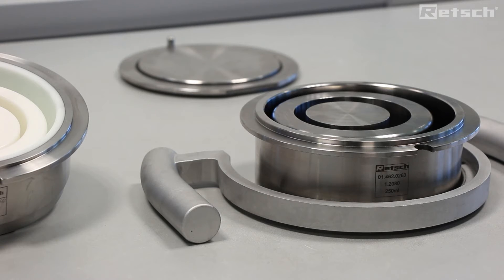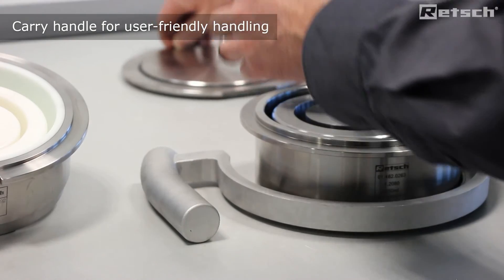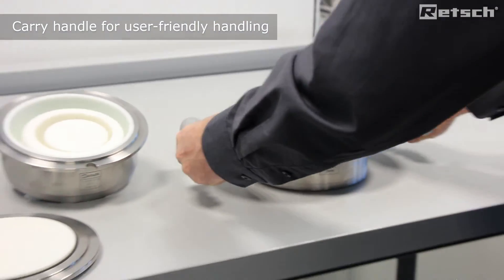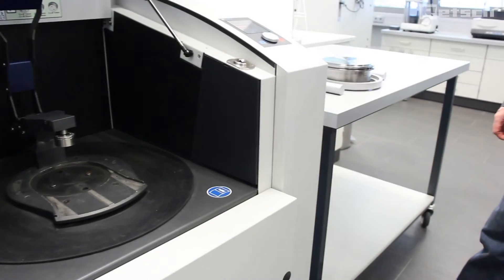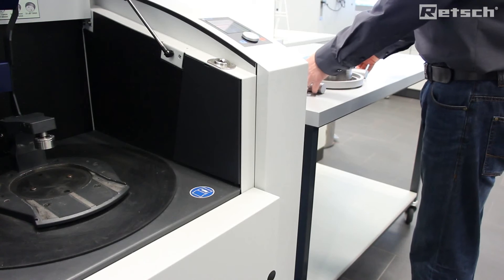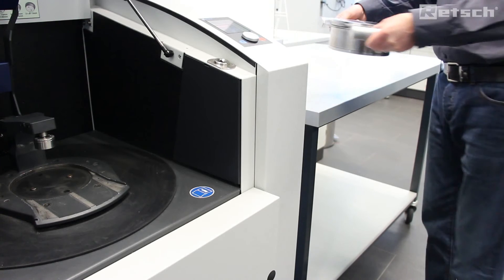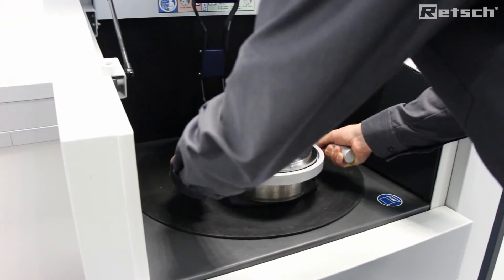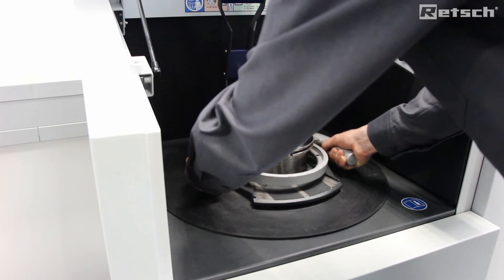The instrument is also supplied with a carry handle, which is used to optimize user-friendliness for carrying the grinding sets. We simply use the carry handle supplied with the instrument to transport the grinding set. We offer it up to the guide rail and simply slide in until it's secured on the locator pins and remove the carry handle.